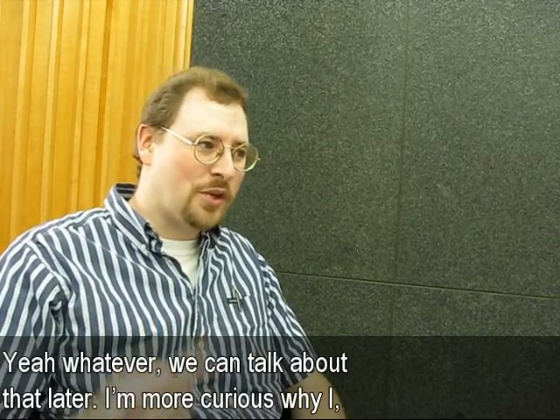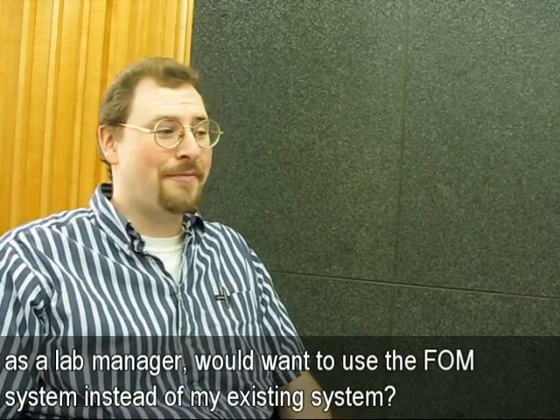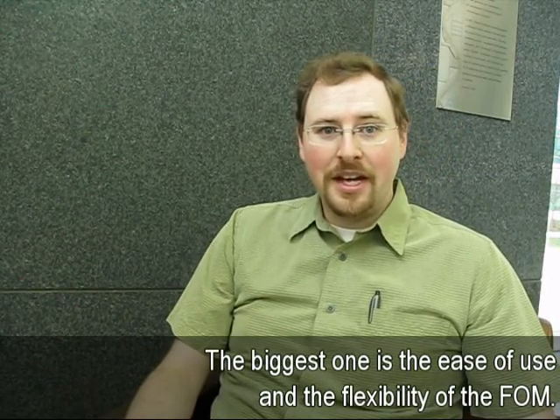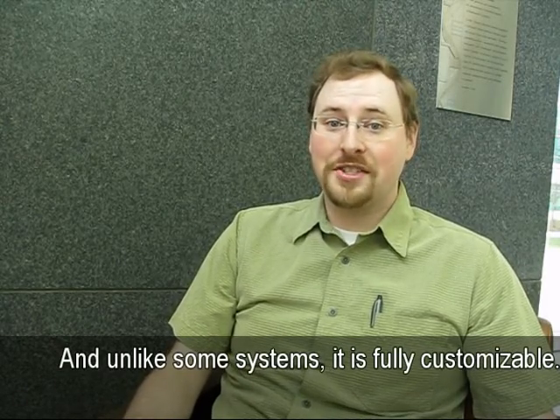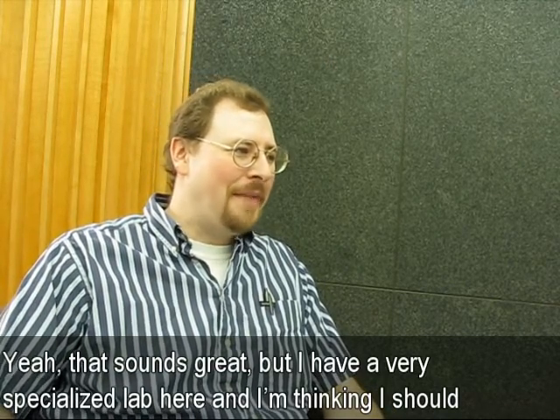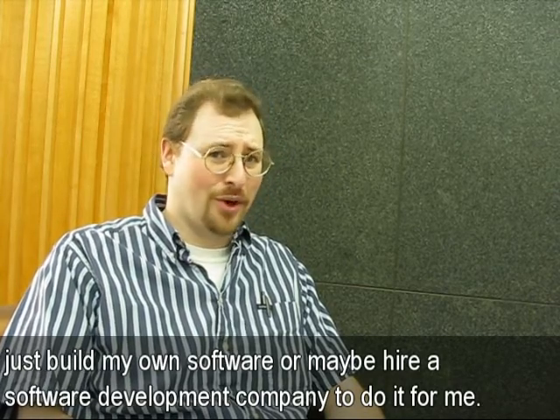I'm far more curious as to why I, as a lab manager, would want to use the FOM system instead of my existing system. Well, the biggest one is the ease of use and flexibility of the FOM. You can set it up to do just about anything your lab requires, and unlike some systems, it is fully customizable. Yeah, that sounds great, but I have a very specialized lab here, and I'm thinking I should just build my own software, or maybe hire a software development company to do it for me.